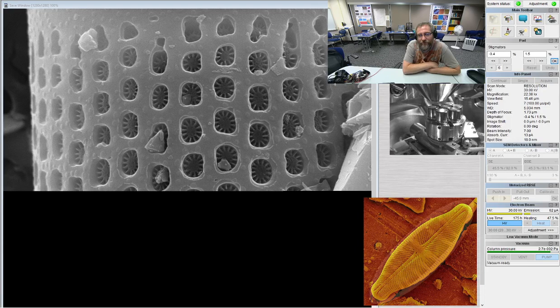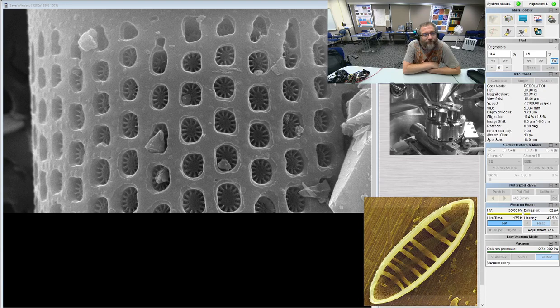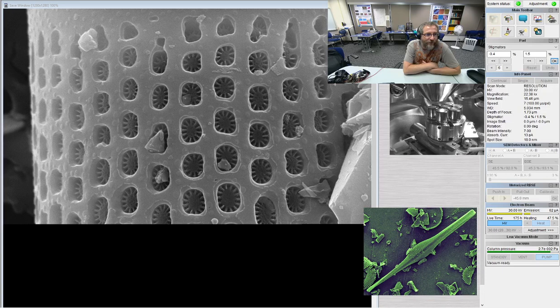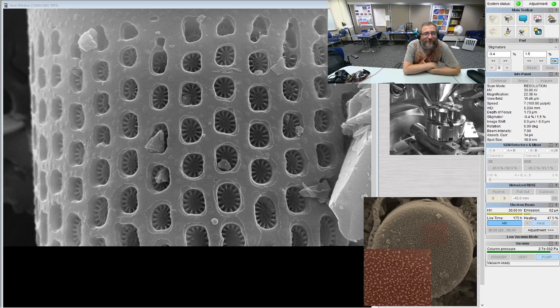This object is a diatom. That's an Aulacoseira. The genus is easy, unless we wanted to get fussy about areolae and things like that. Swimming buttress. Floating buttress.